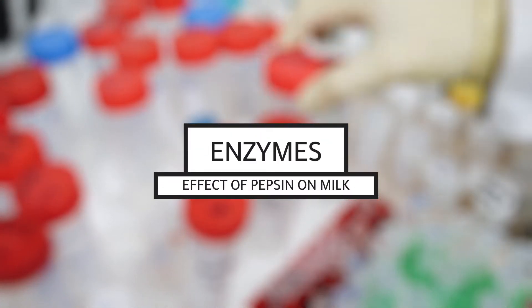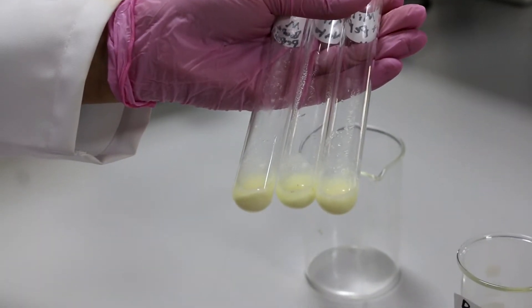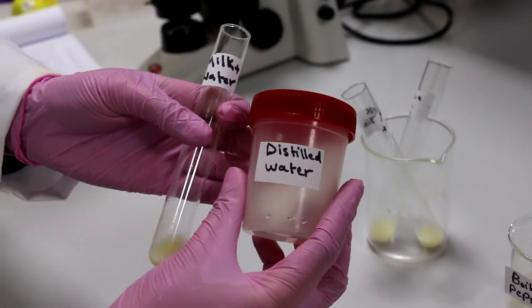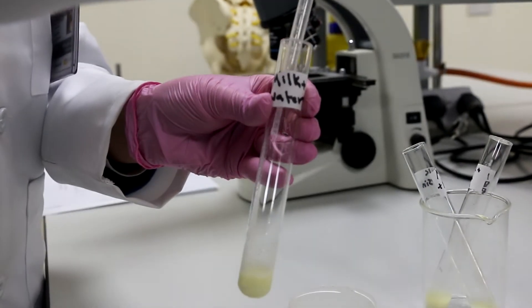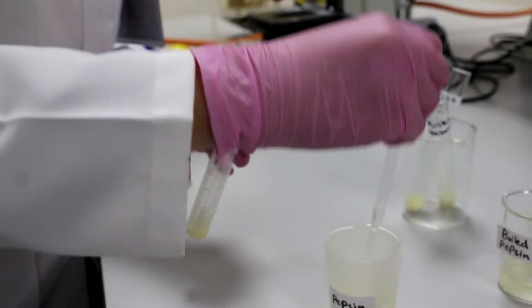Effect of pepsin on milk. Place 3 ml of milk in each of the test tubes. Place 0.5 ml water in one tube, 0.5 ml of pepsin in another.